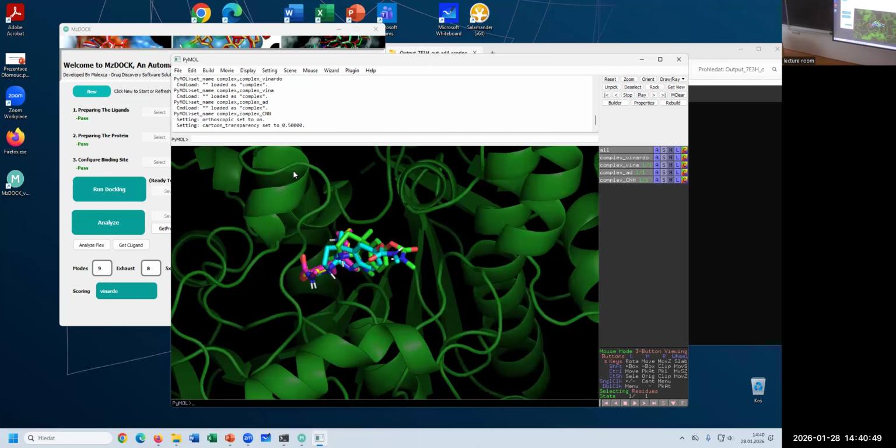I'm probably linking back to the question from the previous lesson, but I would like to know if it is possible to use this software to dock RNA structure. So as far as I know, RNA structure, such as microRNA. Okay. And as far as I know, there are software set on protein or amino acid. Yes, if I could use a predicted RNA structure from another tool and then run.